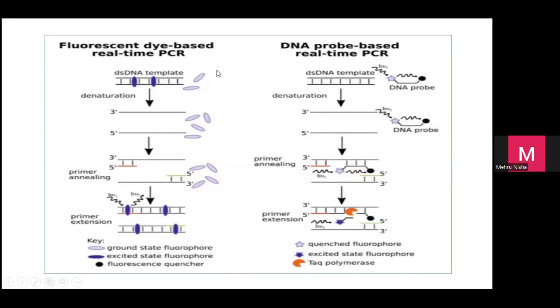So ada dua cara. Yang qPCR ni ada dua teknik. Either you nak beli yang fluorescent dye yang I explain tadi. So dye ini dia datang dengan color lah, PCR mix. You just masukkan dalam PCR reagent dan lari PCR seperti biasa.